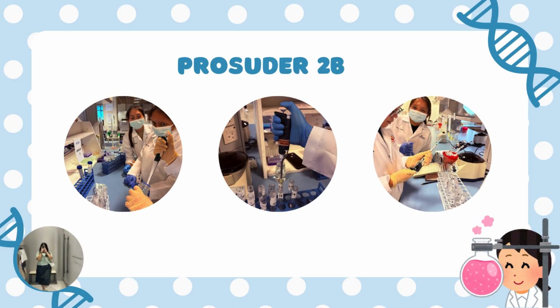After that, we put distilled water in the six tubes. In the first tube, we leave 0 milliliter. And in the second tube, we put 500 microliter of distilled water. While in the third tube, we put 750 microliter of distilled water. In the fourth tube, we put 900 microliter. Then in the fifth tube, we put 950 microliter. And in the sixth tube, 1000 microliter. Next, we put the DNS reagent in each tube.